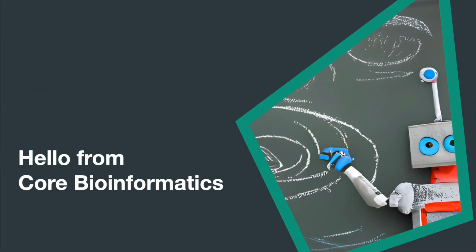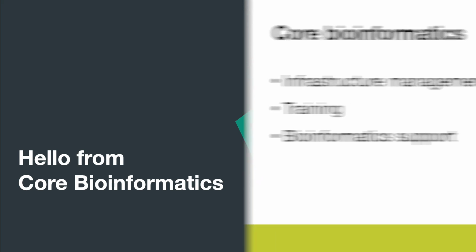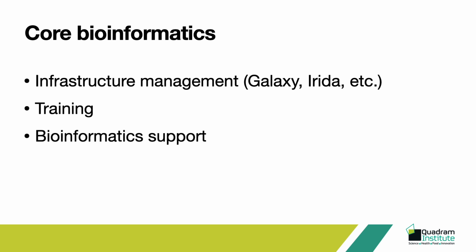Let's get started. Before we delve into the specifics, let's take a moment to discuss our remarkable core bioinformatics team. Our core bioinformatics team plays a pivotal role in managing the QIB bioinformatics infrastructure, which comprises not only the IRIDA platform but also a comprehensive Galaxy instance for genomics analyses. Additionally, we offer a cloud environment that allows us to create customized virtual machines tailored to the needs of QIB researchers. Our core bioinformatics team provides regular training opportunities, equipping you with the skills and knowledge needed to navigate and utilize our bioinformatics infrastructure effectively.